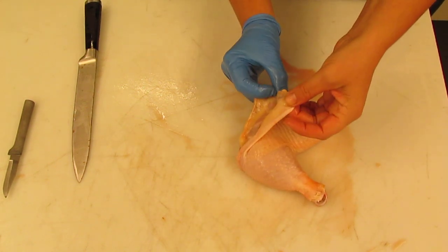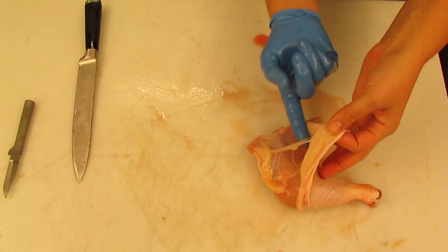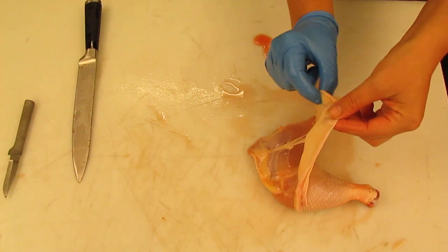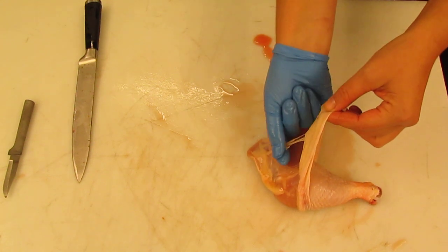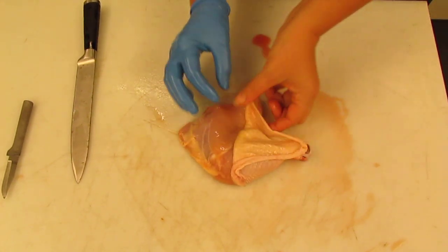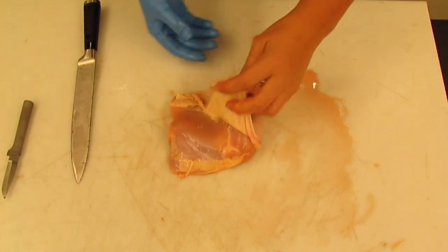All right, the first thing that you should do is start to peel back the skin, okay? As you do so, right, peeling it back, no need for a knife here, you should see that there is this slimy connective tissue that is actually attaching the skin of the bird, right, the integumentary system, to the underlying muscle. This is called fascia. All right, so let me get this a little bit closer for you. This is called the fascia, right? Nice and slimy. It's really easy to tear through. Okay. So those are two things that you will need to identify.